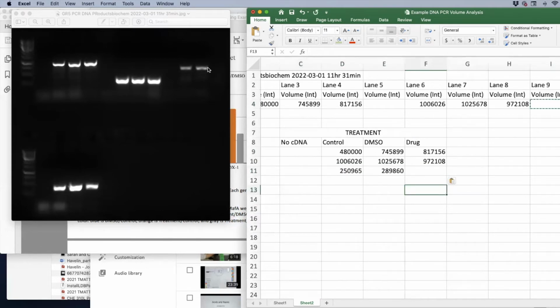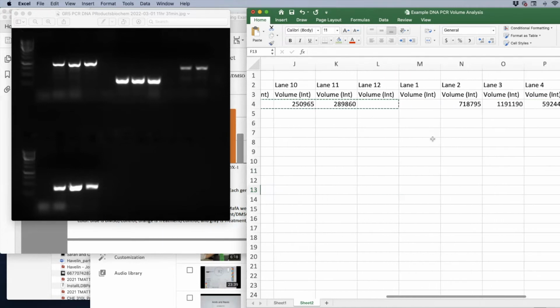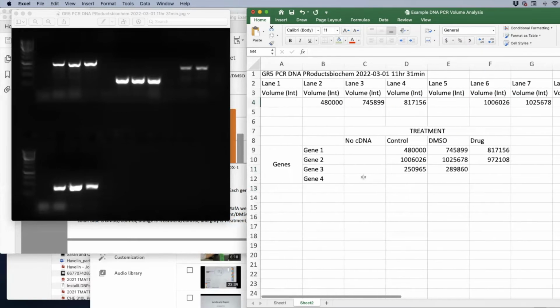And so you'll notice that for whatever reason, there's no signal in this lane. That could be because of so many things. Like I could spend 30 minutes coming up with why it might be blank. It's not important right now. It is blank. And then TBP, copy, paste. I'm going to change this to TBP.